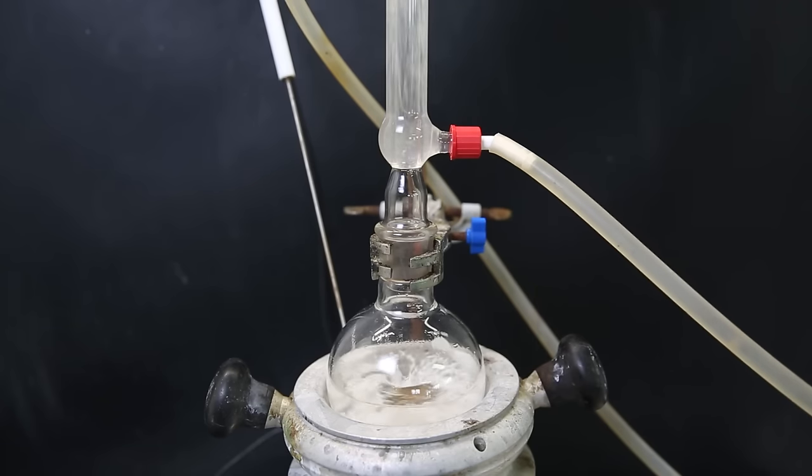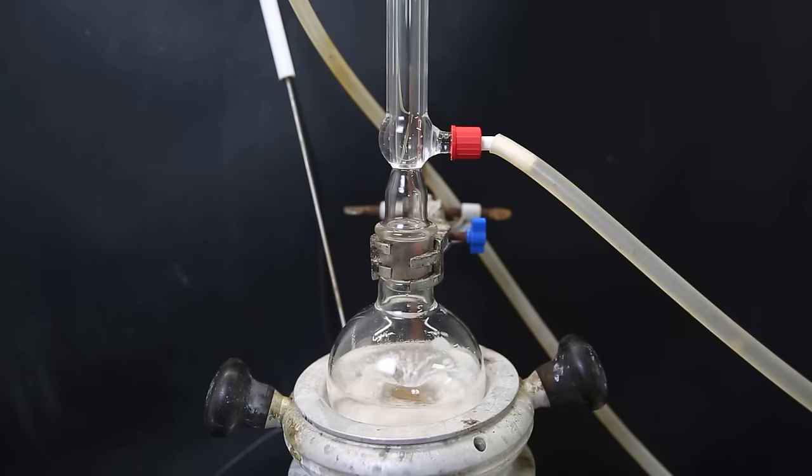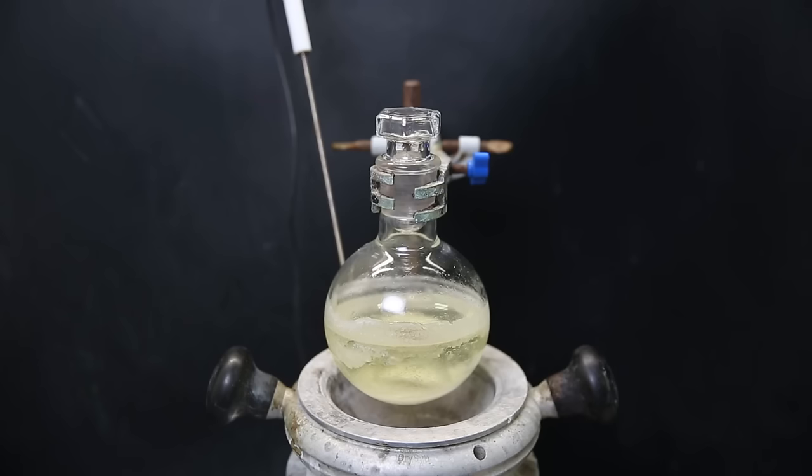I replace the stir bar to make it stir better, and then set it up for a reflux. In this reaction, 2 of the ditosylates react with 1 diamine to form 222-cryptand. The mechanism is basically the same as we have seen before when we made the azide. The amine attacks the carbon adjacent to the tosylate, and the tosylate is kicked off. The only difference is that this time, it has to be deprotonated by the sodium carbonate. I left it to reflux for about 4 days, and when it was done, it had become yellow.